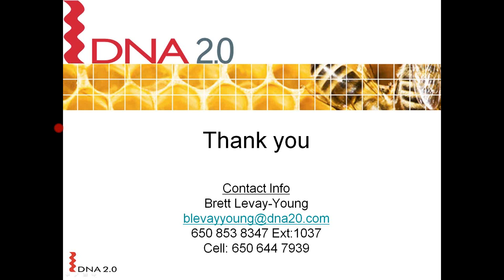Okay, so this is a question that you can try to address using an alanine scanning library. But I'm going to start making stuff up here. Let's say that you have a protein which is 400 amino acids in length, and you have no idea what's going to be the most useful area to look at in a library.